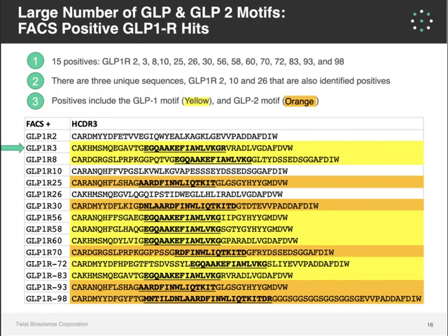We also found several fully human CDR3 sequences, which are shown in white. So we saw a nice variety of different sequences, and also several that made sense based on the target we panned on. The GLP-1 peptide motif was a very small percentage of the overall oligo pool, but in the context of panning against this target in phage, we were able to pull out some very specific binders that use this motif to guide binding and have function against this specific receptor.